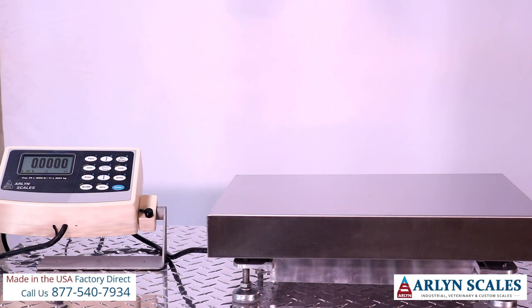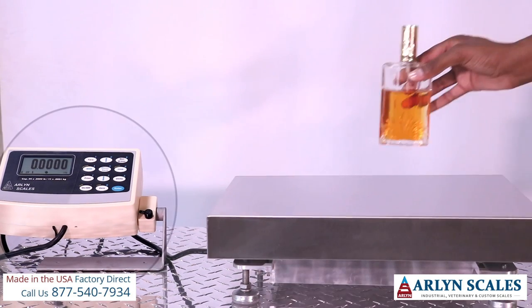Today we are looking at Arlyn Scales Ultra Precision line with our patented Surface Acoustic Wave technology. They are extremely sensitive and we will demonstrate that with this bottle of perfume.